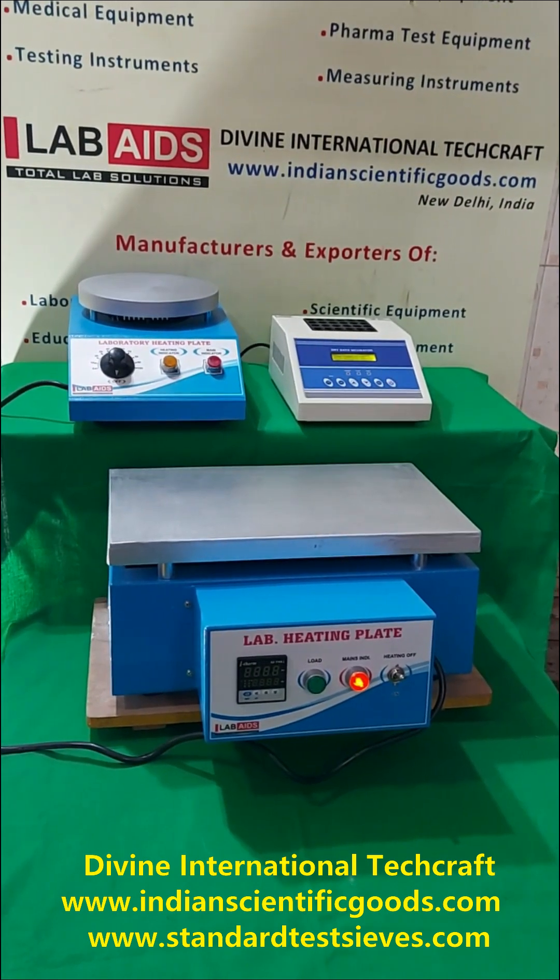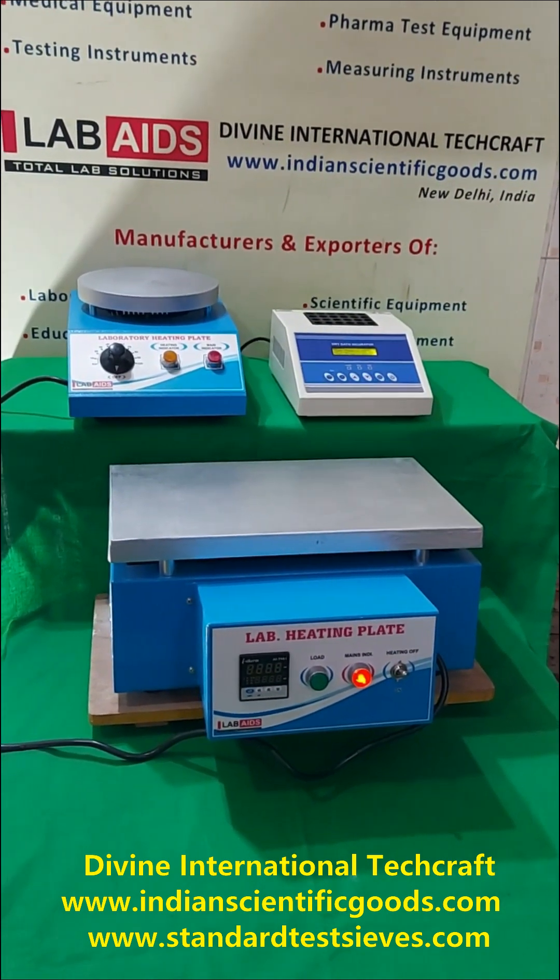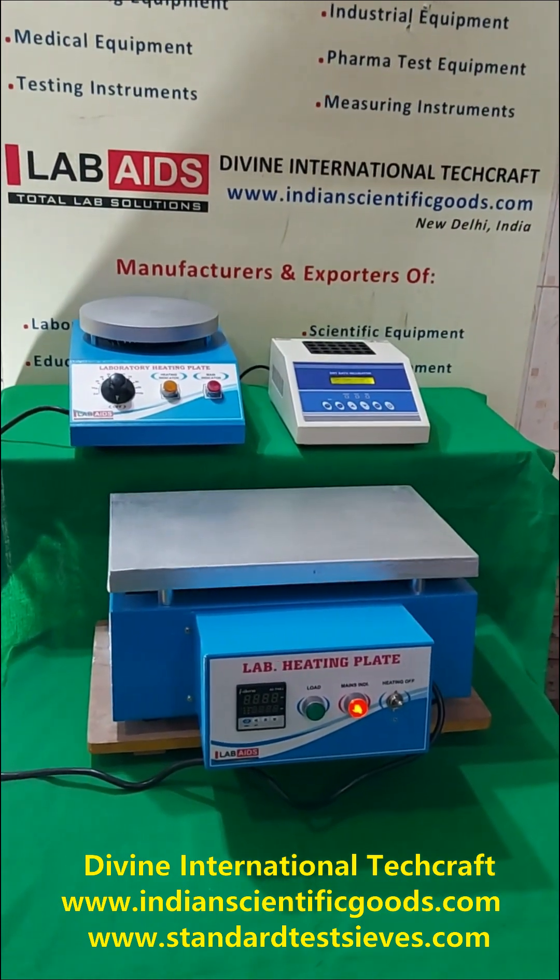Hello, these are hot plates or heating plates and block heaters manufactured by Divine International Techcraft, New Delhi, India.